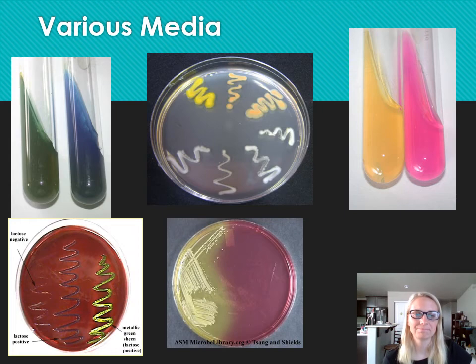Okay, all right. Those are some general ideas on growing bacteria. Another cool thing about growing bacteria is that we, the humans and researchers, can adjust the ingredients in the media that we grow the bacteria on, and that allows us to learn some information about our organisms. I have a wide variety of media pictured here. It can be selective in that it allows only certain bacteria to grow. It can be differential in that the bacteria can grow, but they might grow differently, which tells you something about the organism.